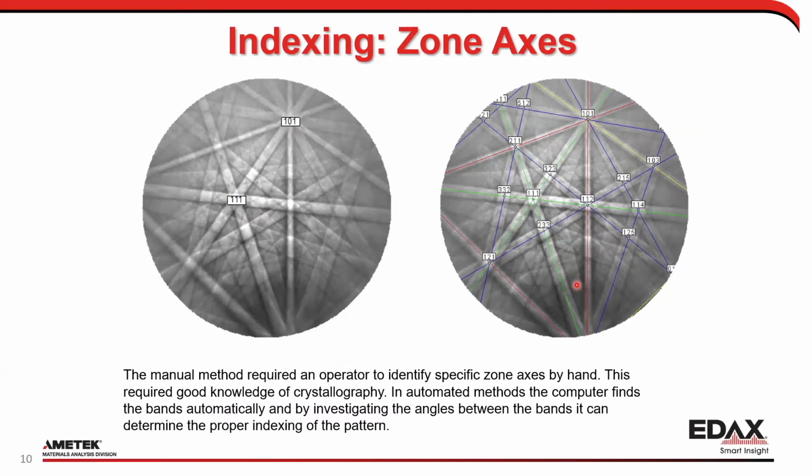Luckily for us, again, computing power is much easier nowadays, and because of that, automated methods can find these faster than you. No offense to any of you, but they can actually do it better than you as well. So these algorithms exist that again can kind of do this process for us, and again, we should be thankful for that. Back in the day when this all kind of started, most of the PCs were doing less than a pattern per second, and now we're doing over 4,500 patterns per second. So we should all be very thankful that computers are awesome.